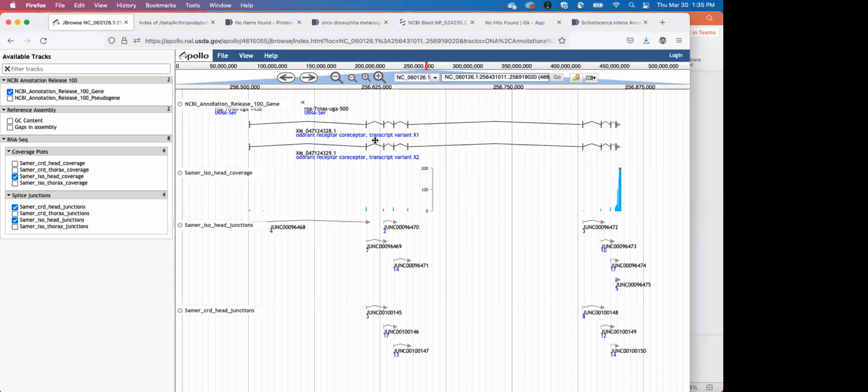If the reference data that RefSeq used to generate the homology-based portion of the gene prediction perhaps did not include that information that you have now, and therefore they didn't predict it. In that case, you want to go to the genome sequence, and you can't use our blast to do that. You'd have to do that from NCBI. So that might be another take if you're going to search your sequence space more thoroughly in that particular case.